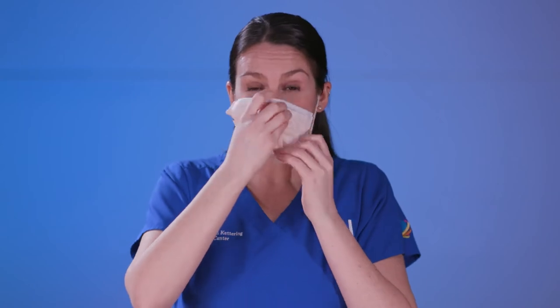Next, we're going to secure the mask over the bridge of the nose, pinching, making sure again to have a tight seal. Pull the mask under the chin and then check to make sure there's no air leaking out. And it's as easy as that.